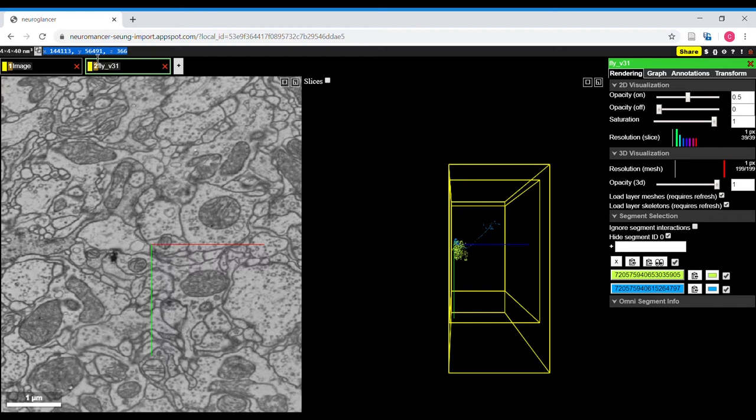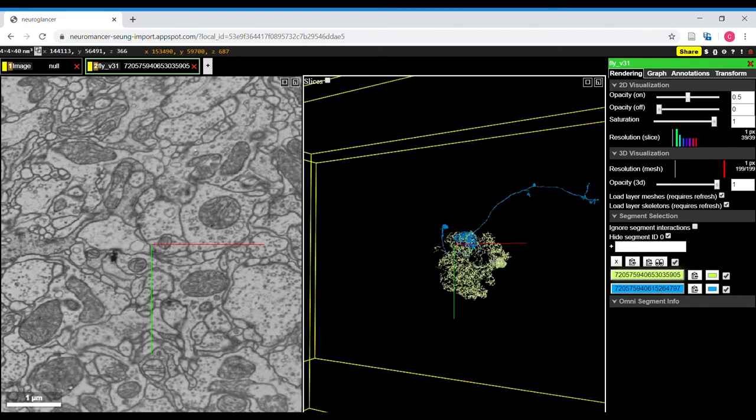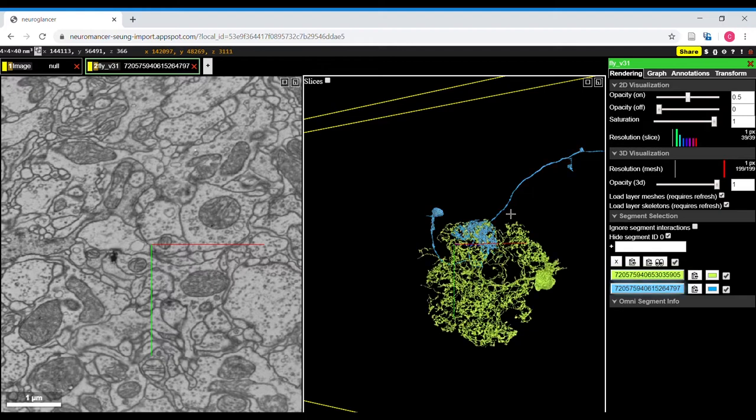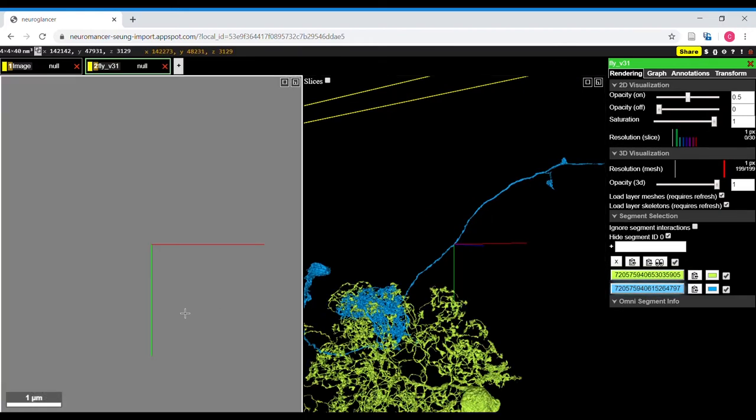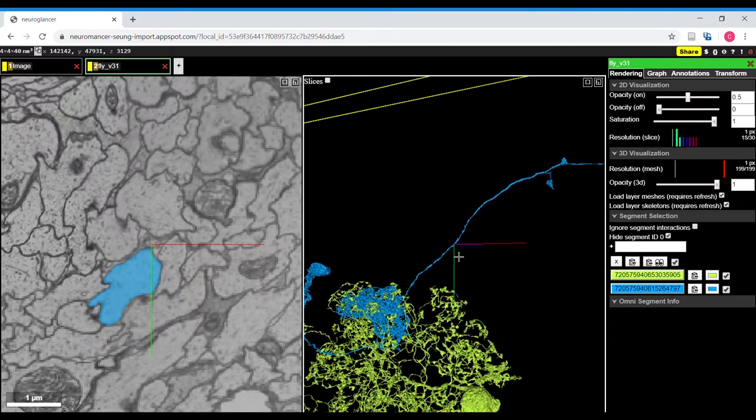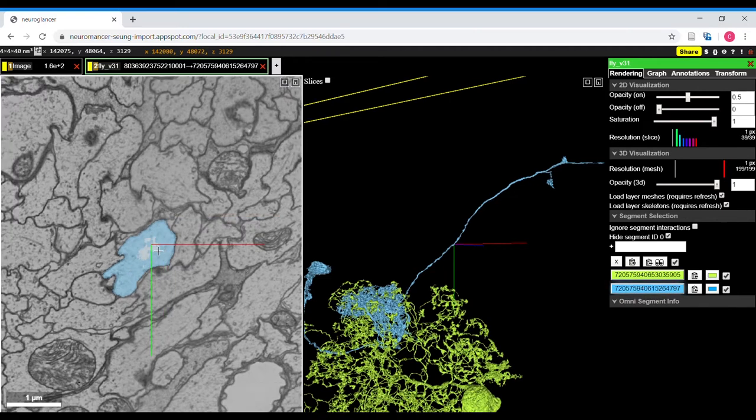If you want to save your work, coordinates are a very useful way of doing it. You can right click on something that you're working on. Let's say I was working on this blue neuron. I right click to center it and then right click to make sure the crosshairs are really within it.